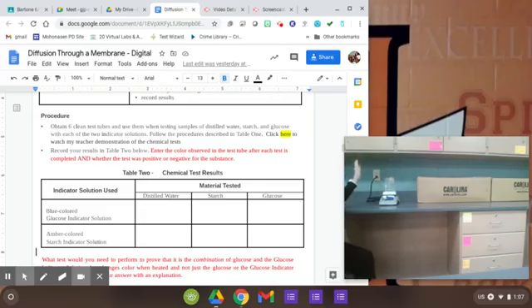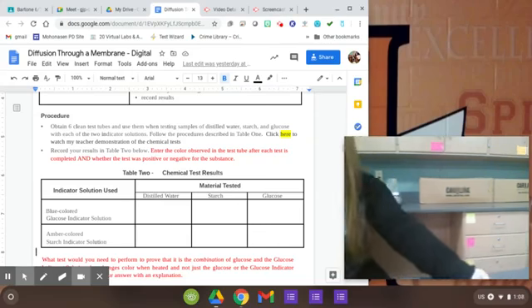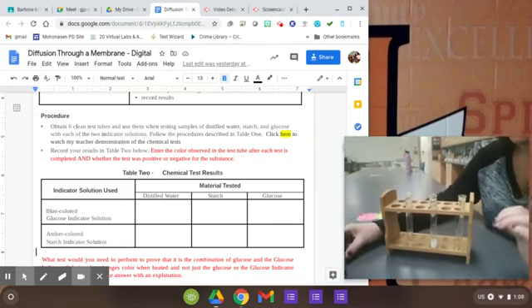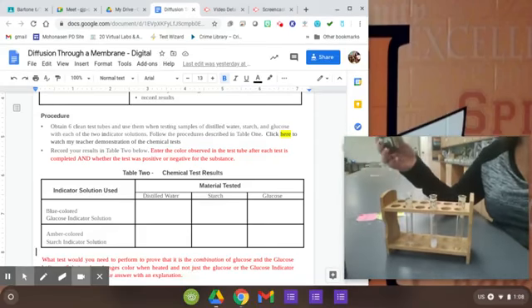Okay, I'll put those in there. I'm going to let them sit for a few minutes. In the meantime, I'm going to test these ones. Okay, so starch indicator doesn't need time. It doesn't need to be heated.